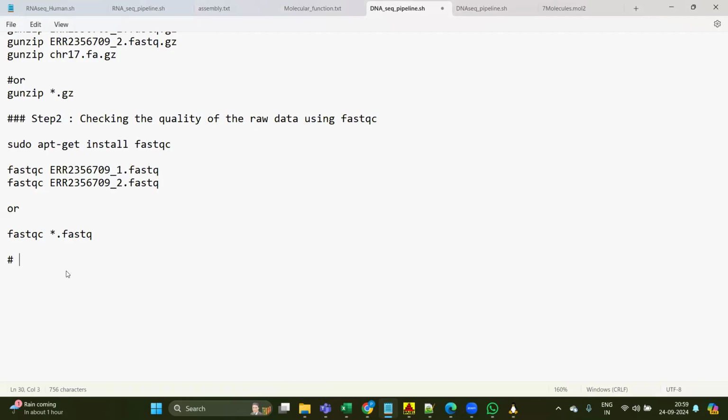We are going to focus on the three most important parameters that should be checked.